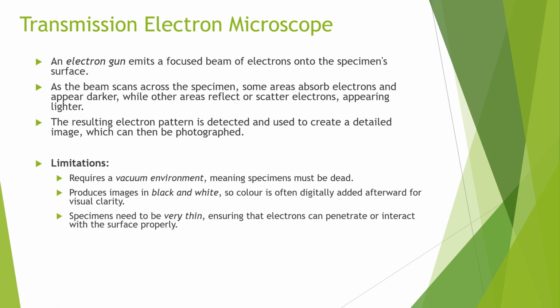Another limitation is the specimen's thickness. The sample must be thin enough or prepared in a way that electrons can interact with or penetrate its surface, which can sometimes be challenging and also time-consuming in terms of preparation.